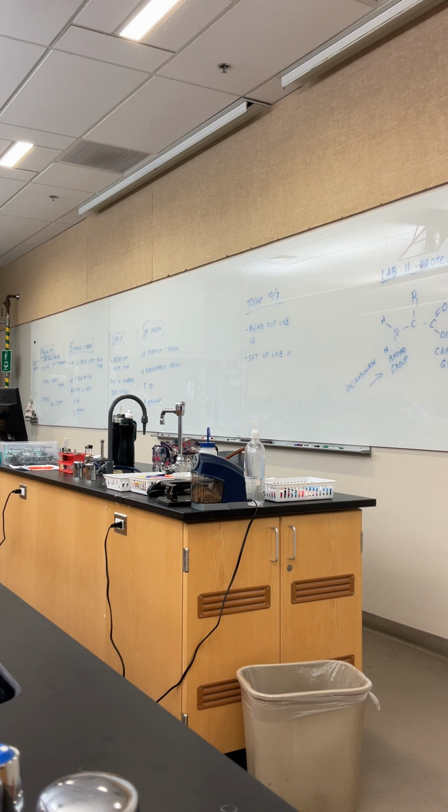And you might be going, well, wait a minute, how can I get gas without an acid? Because sometimes our organisms have enzymes, and as soon as they make that acid, they're going to convert it to something else. So the acid's not going to be able to build up high enough to cause a color change. So that can happen.